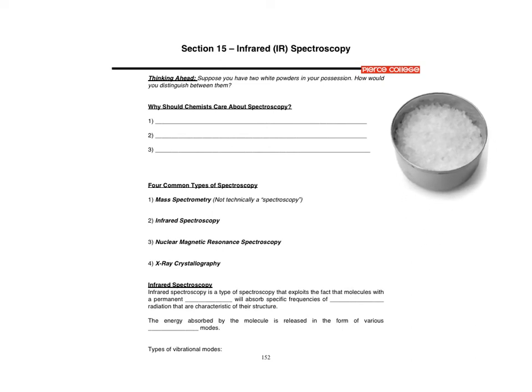So first, I'm going to put this little unknown over there. We're going to do an overview of all the spectroscopies you'll be learning and what that really means. So spectroscopy is a type of instrumentation technique that uses light as the energy source to pass through one of our samples, and the very crude, simplified definition that could apply to them is, if you have your sample, let's say we have this sample here, and we're able to pass light through it, and light has an energy, right? So energy of light, h nu for the photon.